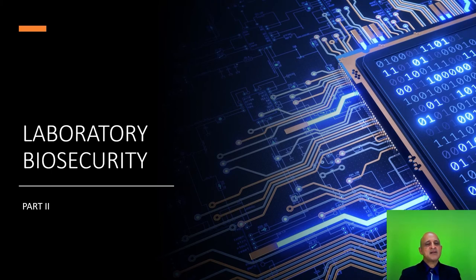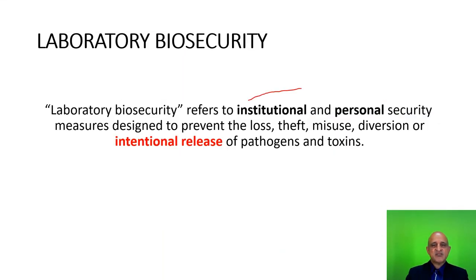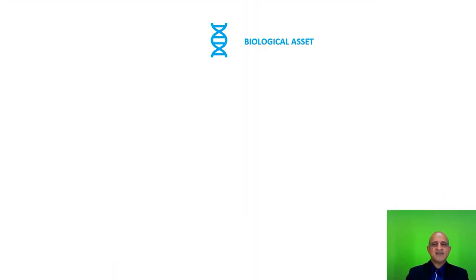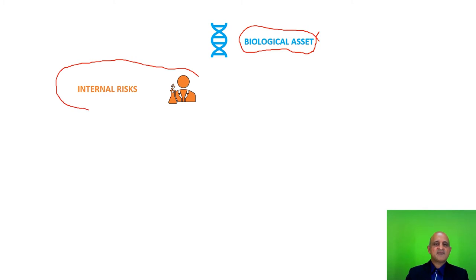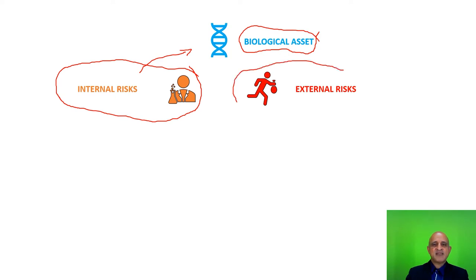We now move on to part 2, which focuses on laboratory biosecurity. Security basically refers to the institutional and personal security measures designed to prevent loss, theft, misuse, diversion, or intentional release of pathogens and toxins. We have our biological asset — I use the word asset as this is a biosecurity term. Internal risks may come from your laboratory workers themselves or from contractors who may have access to the biological asset. External risks may be in the form of data theft or theft of the biological agent itself. As a biorisk manager, we have to address both internal and external risks.